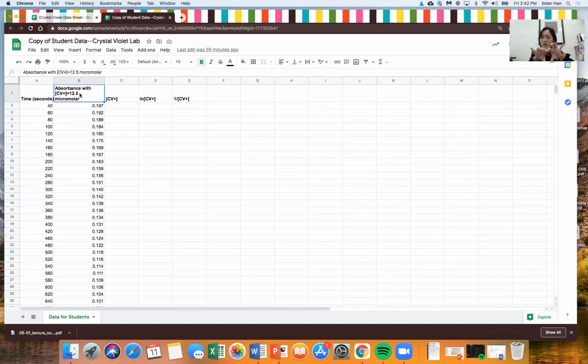So this was poured into a little beaker and stirred, and once the hydroxide starts to react with the crystal violet, it takes off the positive charge from one of the carbons in the crystal violet, and it goes from that deep purple color that you remember seeing last week on Thursday over to clear. So the more violet it is, the less of the reaction has happened; the more clear it becomes, the more of the reaction has happened.